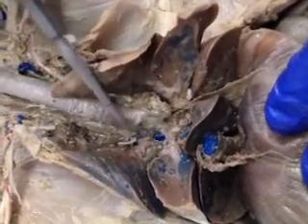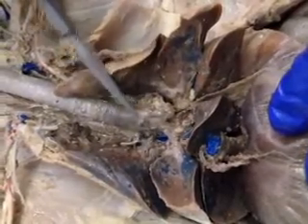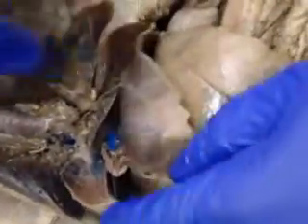The blue stuff that we see here are the pulmonary arteries. This here separates the thoracic cavity from the abdominal pelvic, so that is the diaphragm. And then what we see here on the other side of the diaphragm, right there, that membrane, that is the falciform ligament. So right, the diaphragm will go back for me. Here's the falciform ligament.